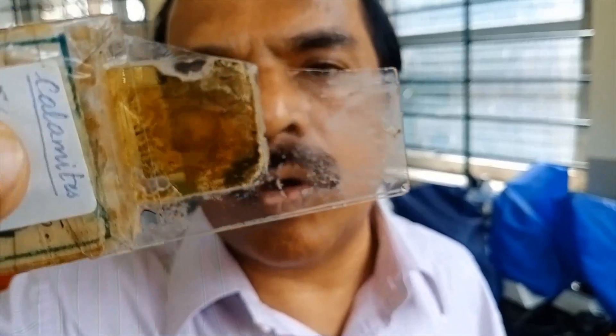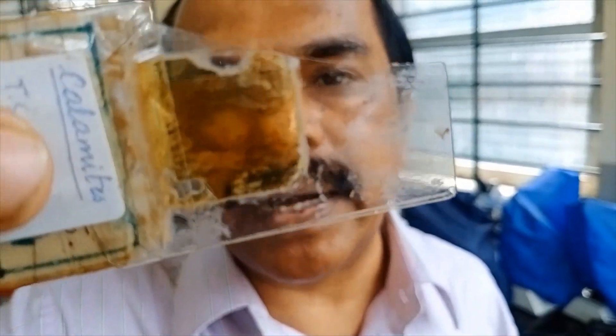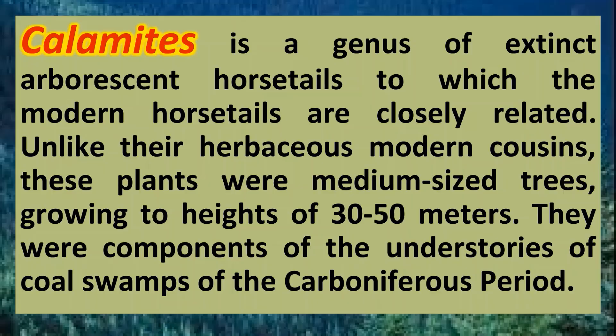This is the slide of a fossil called Calamites. This is the transverse section of the stem, and you can see the arrangement of vascular bundles in this fossil specimen.